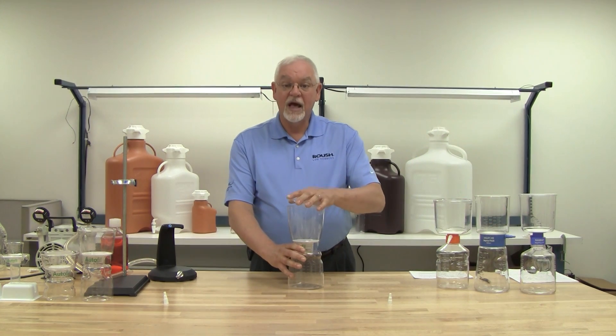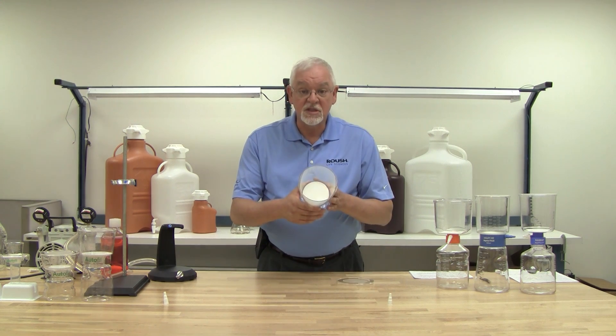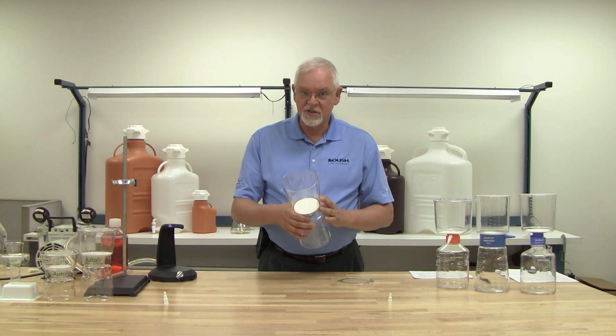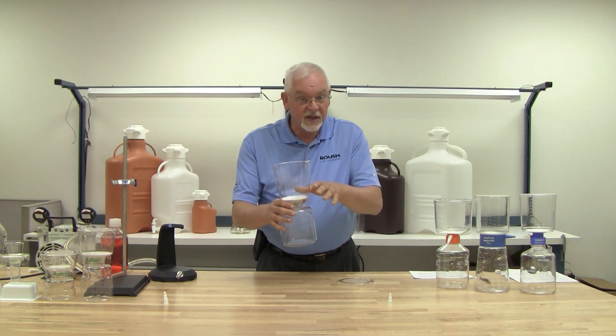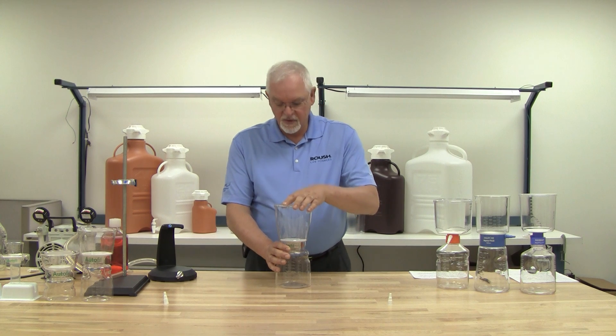In addition, it allowed us to put a very large diameter membrane into the system. What that does for us is it allows for a faster throughput of the fluid down into the receiver bottle.